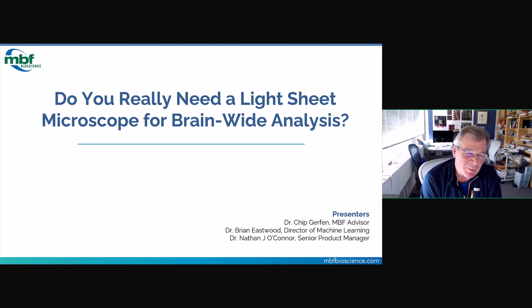One of the things that has occurred during the time that I've been doing neuroanatomy is that the processes have become much easier in terms of mapping whole brains, and clearing and light sheet microscopy has really accelerated the ability to do whole brains.